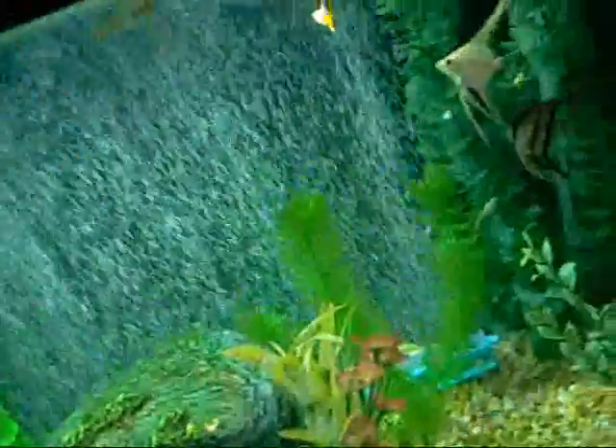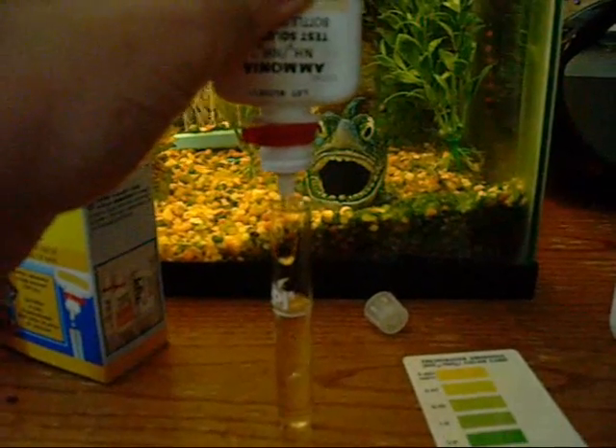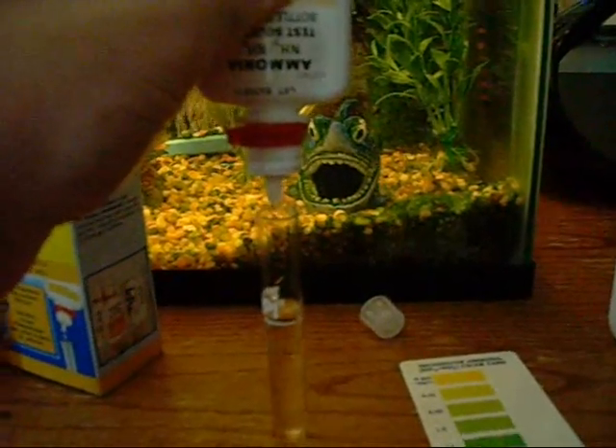Pretty much the same thing for ammonia. Take the same test tube and fill it with water from the tank. You add 8 drops of the first ammonia solution bottle. Then take the second bottle and do the same thing — 8 drops. This second one is harder to open.